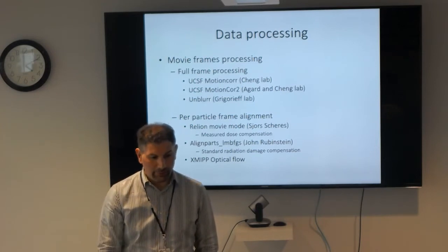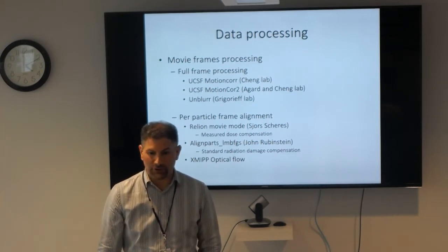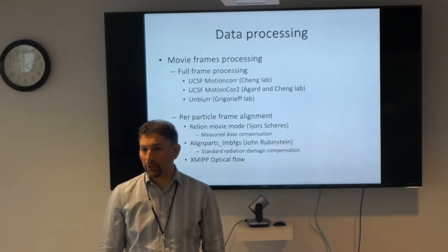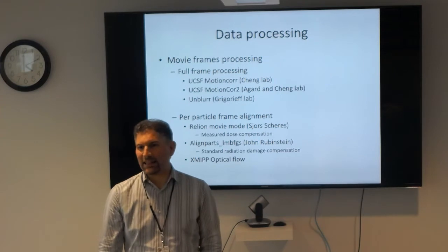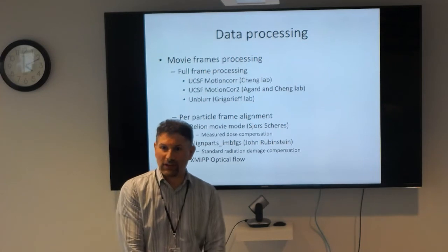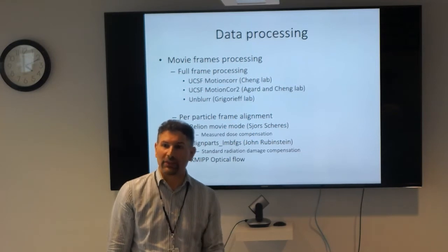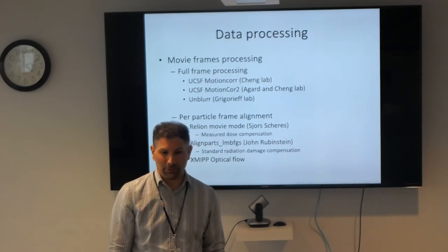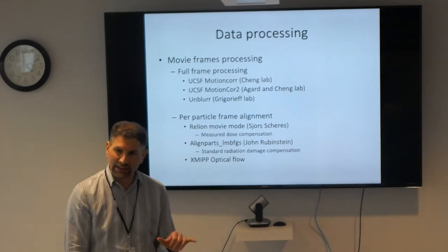So the first time I heard this was from someone from Eva Nogales' lab. My understanding is that in their routine, they go straight into 3D. They do 3D with Relion, and they use a high tau number, something around 24, the tau fudge factor, and it's in their publications. People have different types of strategies, and if you read the part that's not necessarily always fun, the materials and methods section, that's where you learn a lot, right? A lot of the reasons why experiments are not reproducible is because people are not reading the materials and methods, and they go, I can figure it out on my own. So read that part.